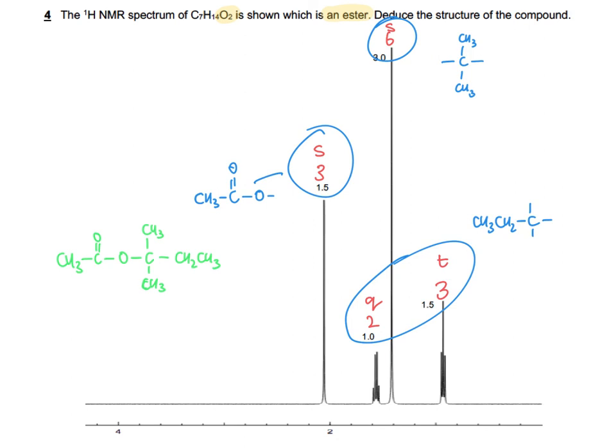One thing I maybe should have done in all of these examples is, one way to do a final check is to work backwards. So once you've got your structure, and you've decided this is the molecule that's responsible for all those signals, go back and imagine you were just given this, and you had to decide how many signals there would be, how many hydrogens would be in each environment responsible for each of those signals, and what the splitting pattern would be.